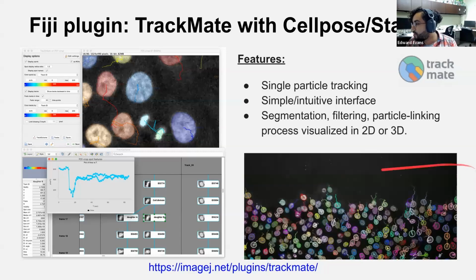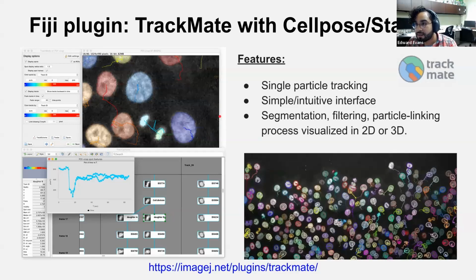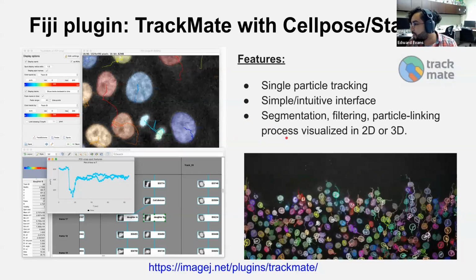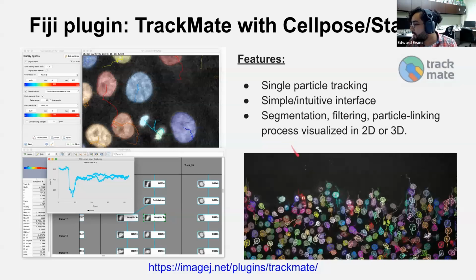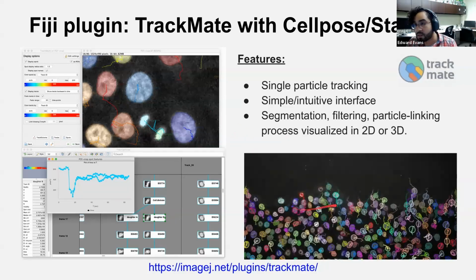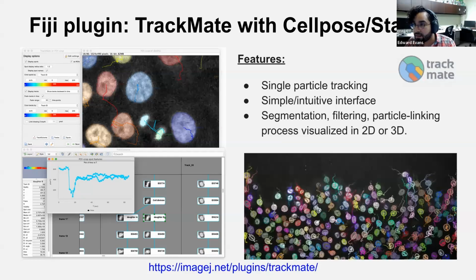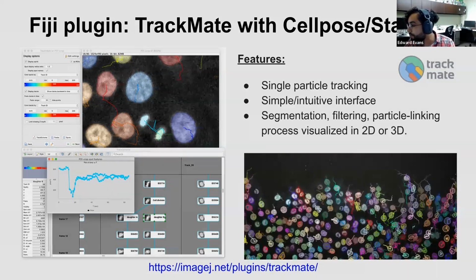And Jean-Yves, the main developer behind TrackMate, was able to include that into TrackMate 7, I believe. And you have to go into the Fiji update sites to check just TrackMate-Cellpose to get this. But after you get that hooked up, it'll find Cellpose for you, and then you get these really cool segmentations of cells coupled with the trackingness of TrackMate, which is really awesome.